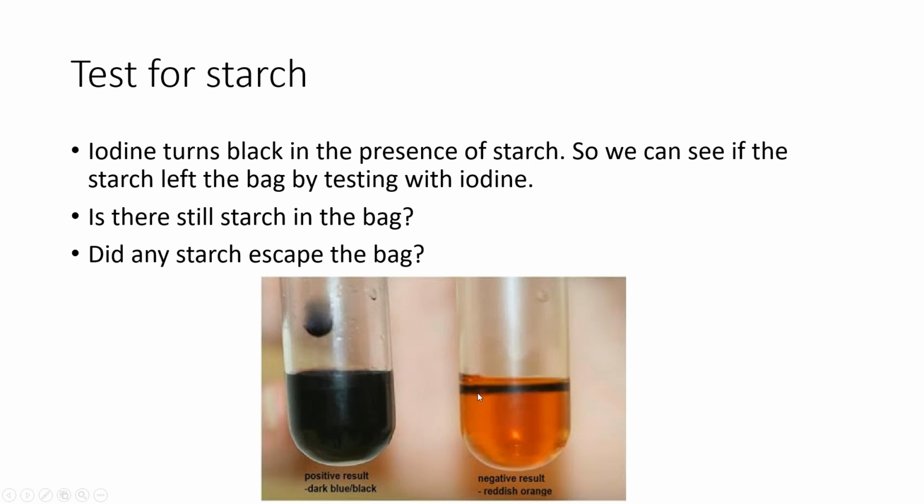This is just a shadow right here. That's not actually black iodine. This is what a black test looks like. And so no, the starch is not able to leave the bag. It's too large a molecule and it can't fit through the little pores that are in the dialysis bag. So, sorry, I read these questions out of order, but for right under the how do you know, and it says use the same test tubes as before, pour the water from the beaker and add the iodine to it.